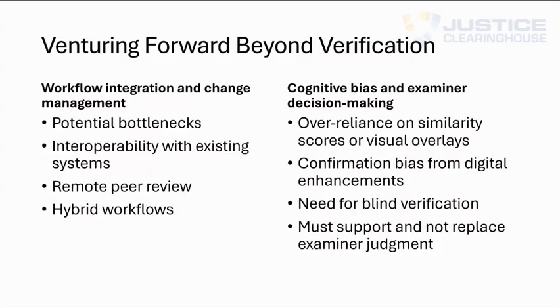The thing that stands out to me is one thing that we emphasize in our training: chamber marks on the side of cartridge cases. Those are really good marks because we know that chamber marks are not going to be influenced by subclass characteristics. At the same time, that means we still have to have some light comparison microscopy. And that also means that VCM can still handle the breech face and the firing pin and the bullets, but what is that hybrid workflow going to look like? And how are we going to manage that?